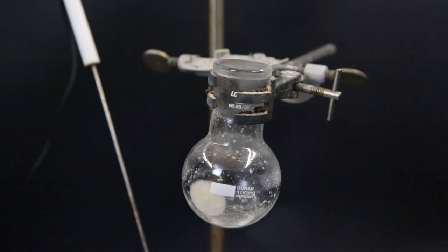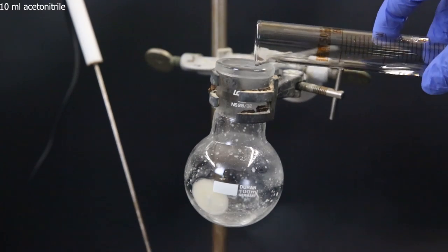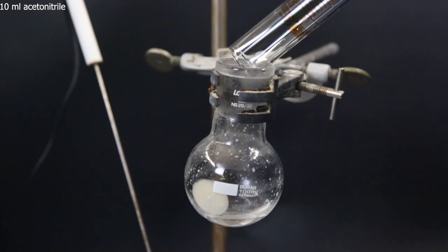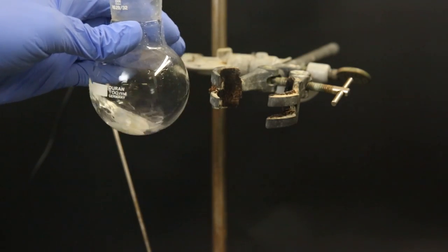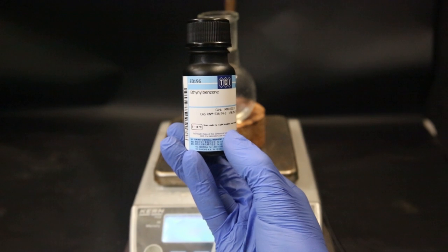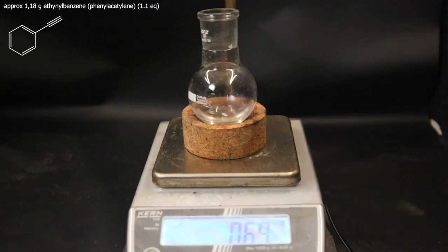Now that I have the tosyl azide, I can start with the click chemistry. So to the flask with the azide, I add 10ml of acetonitrile. I shake it around and the solid dissolves easily. Now I set the flask on a scale and dropwise add around 1.18 grams of ethinyl benzene.